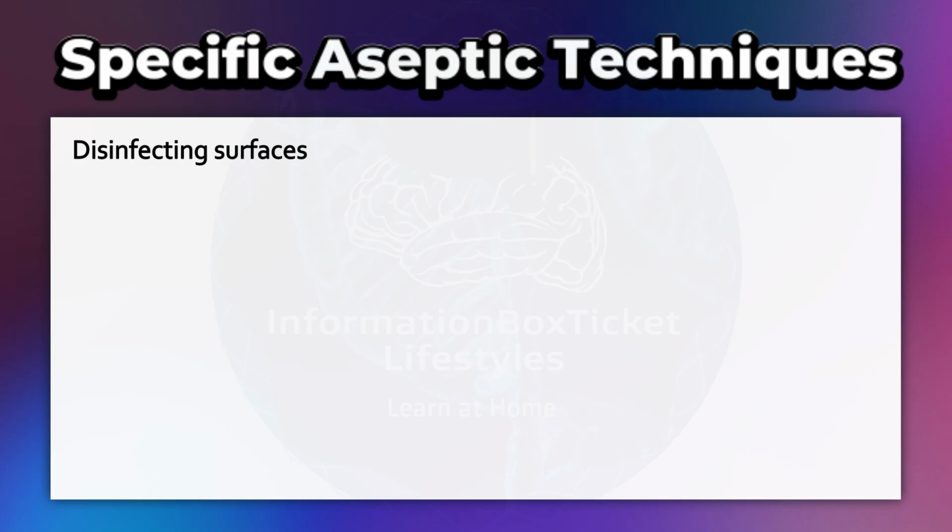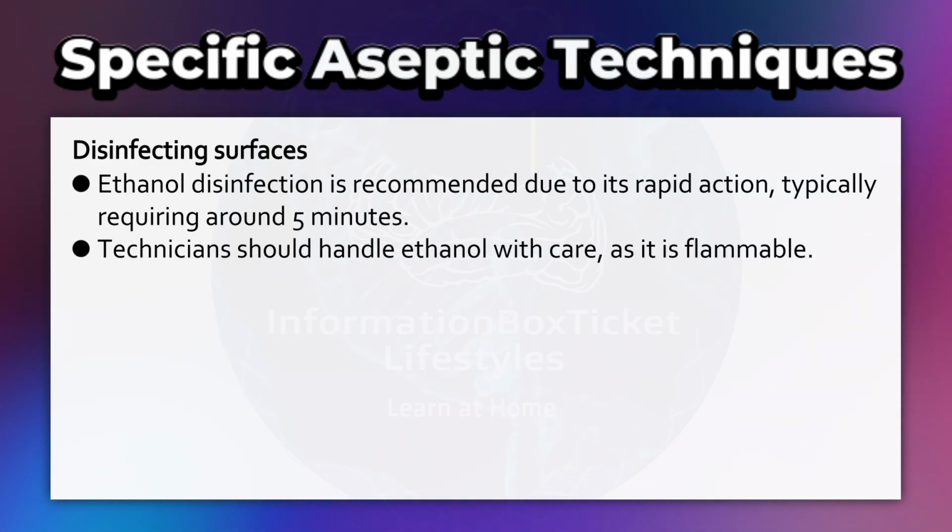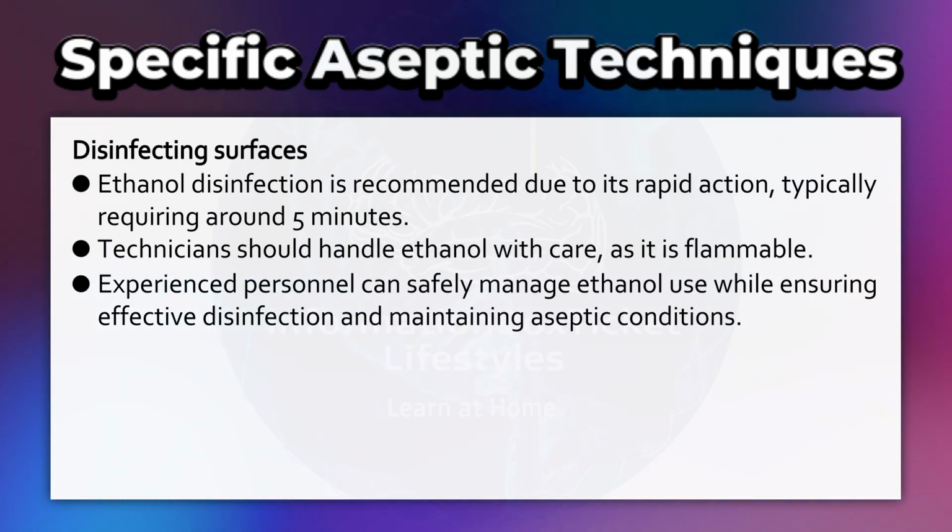Disinfecting surfaces. Ethanol disinfection is recommended due to its rapid action, typically requiring around 5 minutes. Technicians should handle ethanol with care, as it is flammable. Experienced personnel can safely manage ethanol use while ensuring effective disinfection and maintaining aseptic conditions.